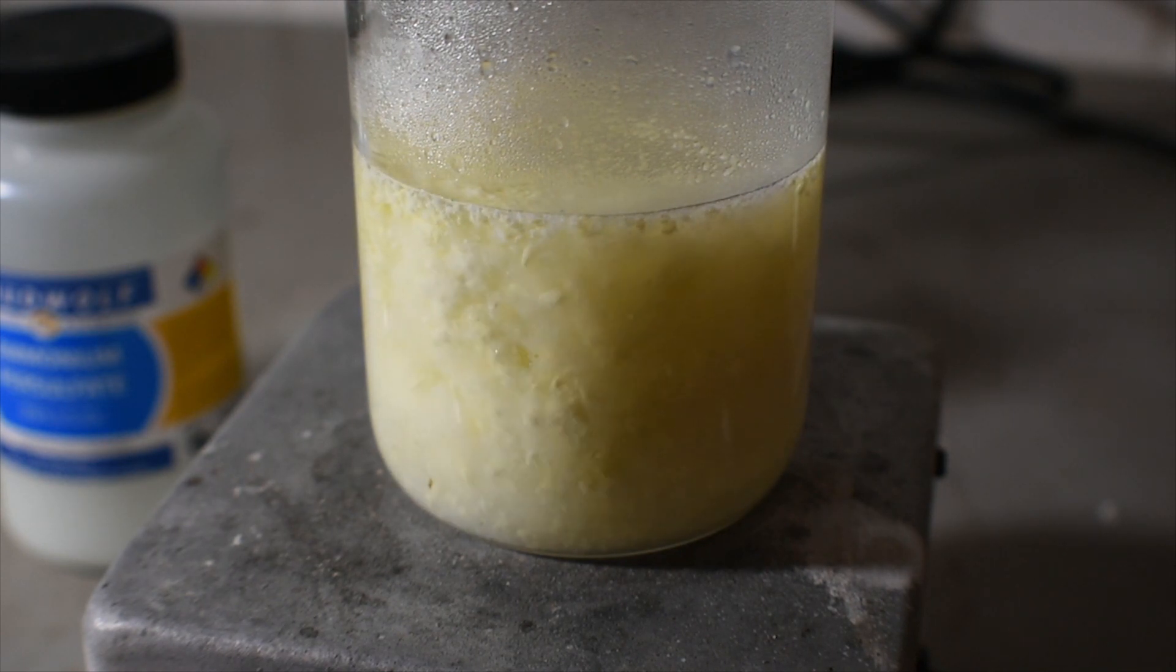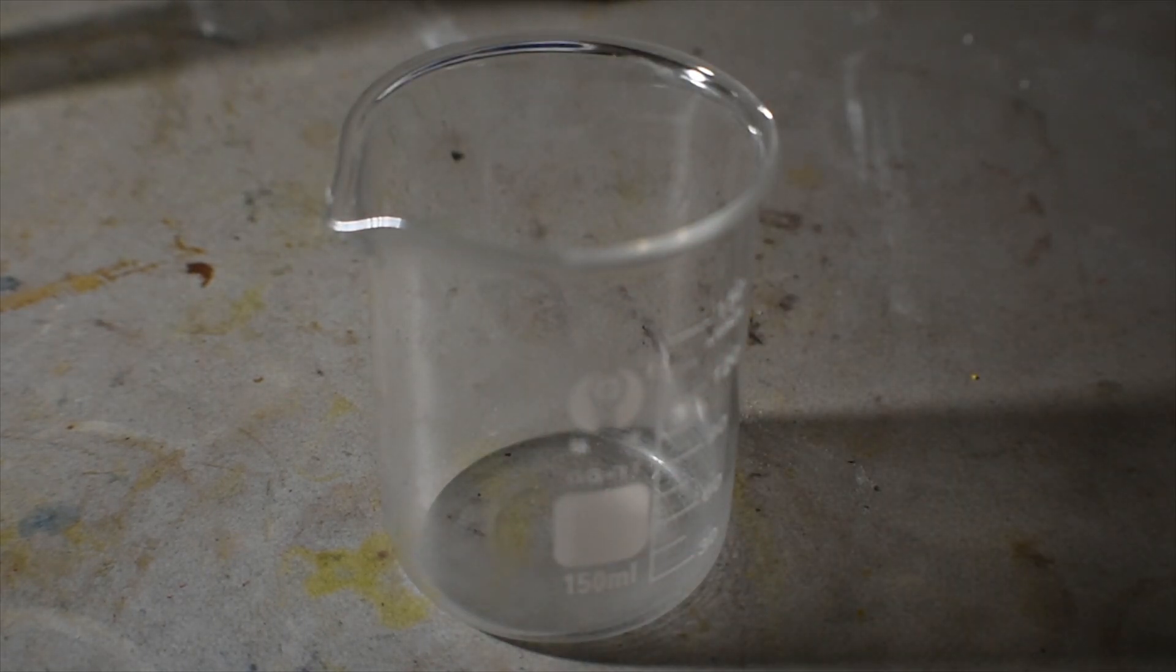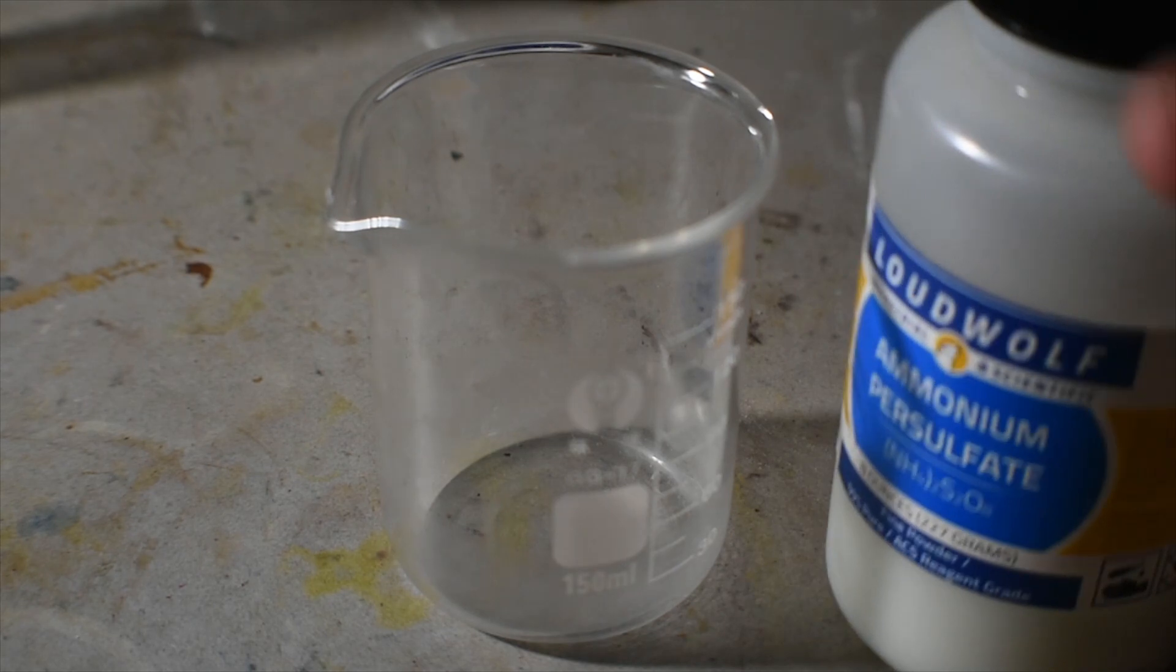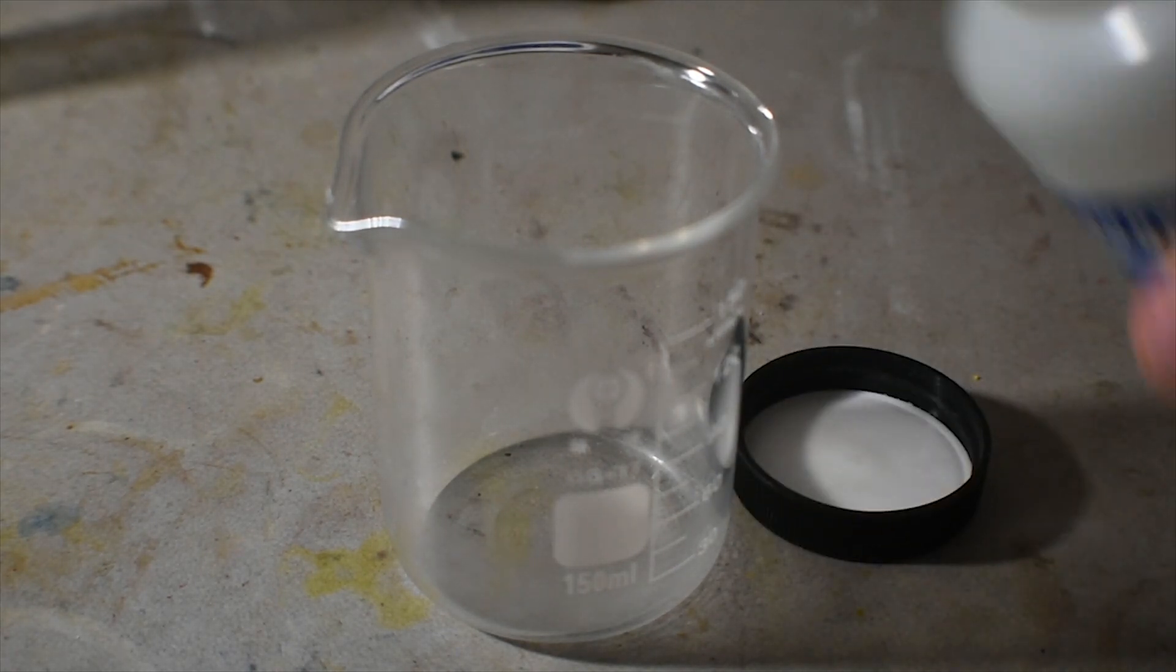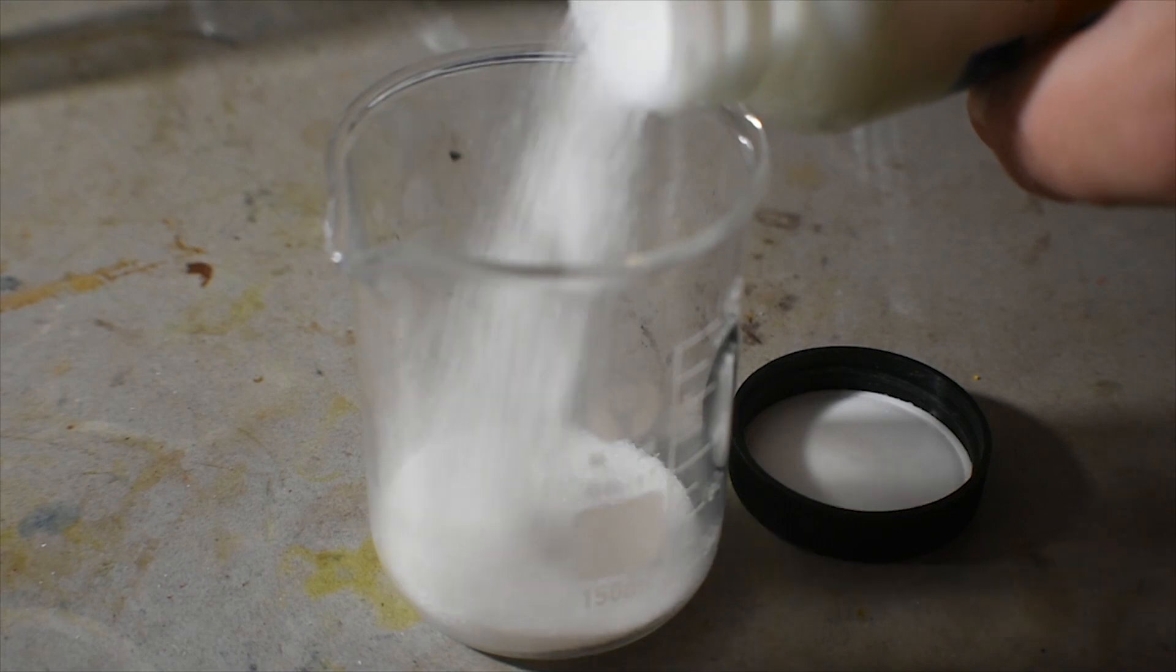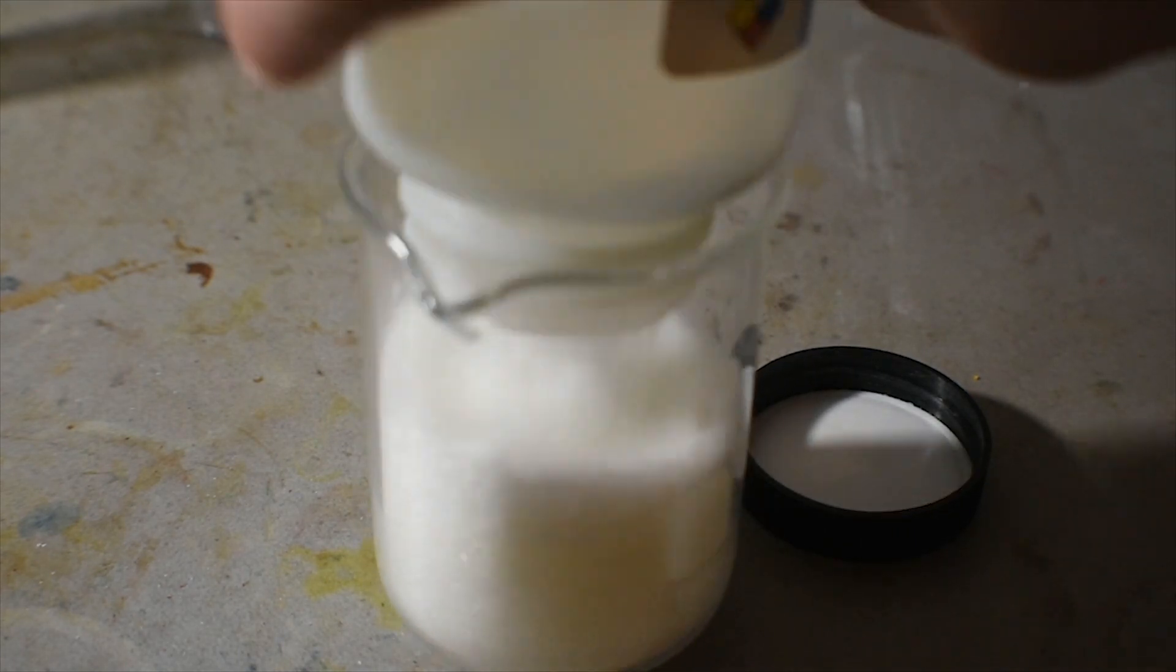While this mixture is stirring, I measured out about five or so grams of ammonium persulfate. The procedure, again, doesn't require any specific amount, so I just went with five grams.